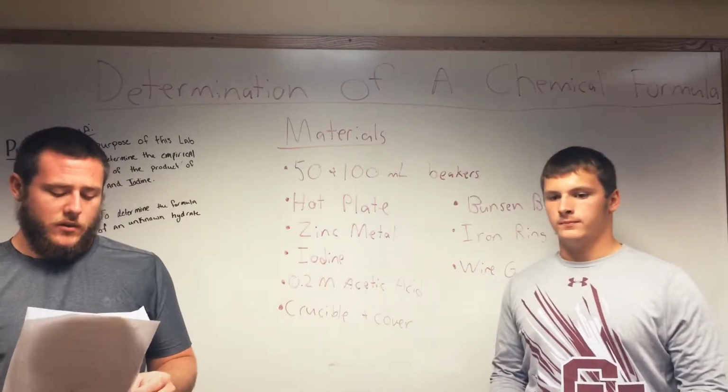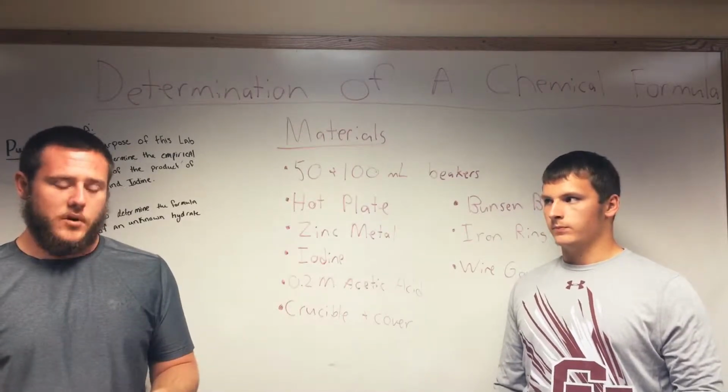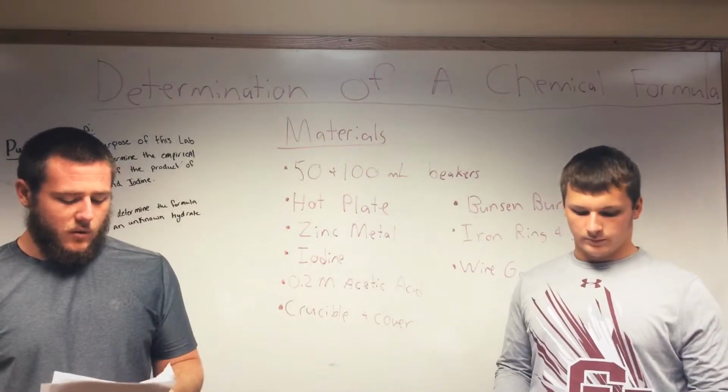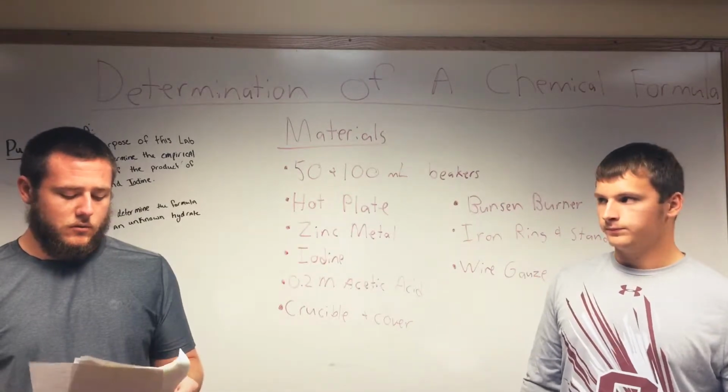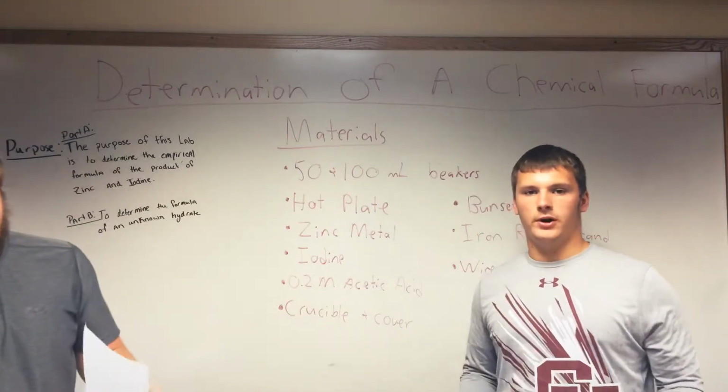We washed the zinc with DI water 3 times, and we dried the zinc on a hot plate. Then we removed it, and once it was cool, we weighed it and got the mass of zinc. That's the end of Part A.